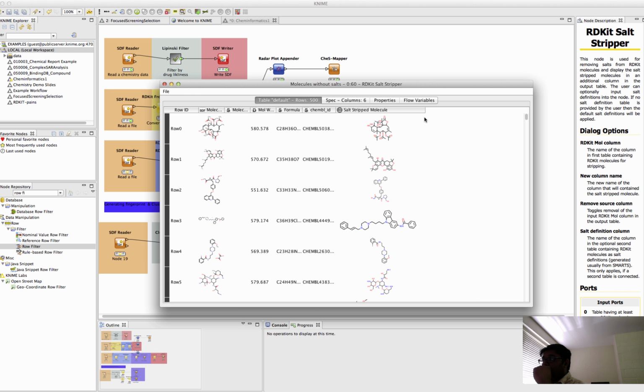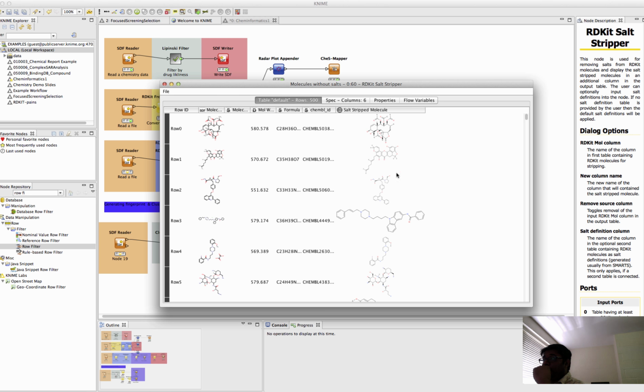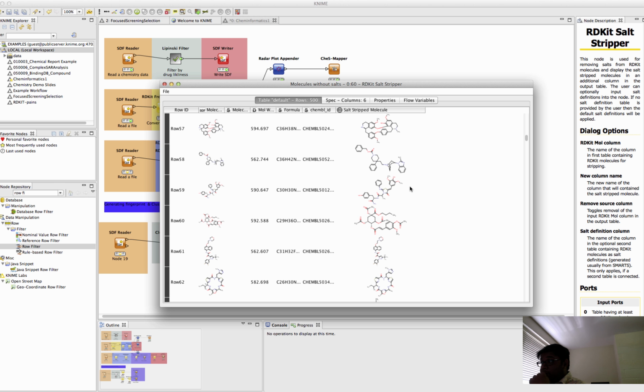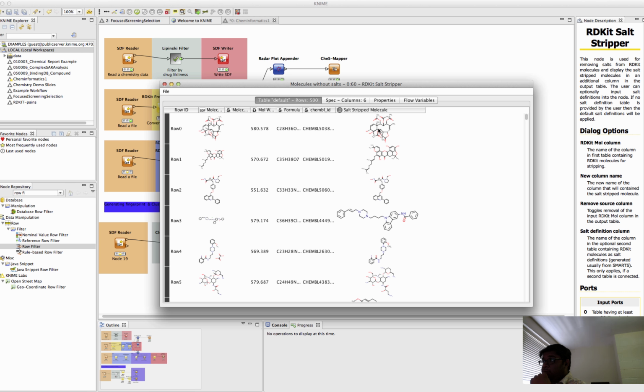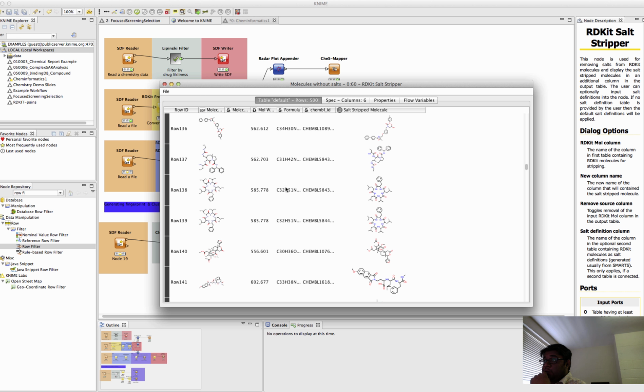you can just maximize. Then just do some Indigo, and then you can see the compounds. They have different renderers. I mostly prefer the Indigo renderer. It is fairly cool. You can also do a Marvin rendering. It's also fairly good and shows the chemical structures. RDKit 2D depiction also shows the chemical structures, the molecules, molecular weight, and then the ID and everything.